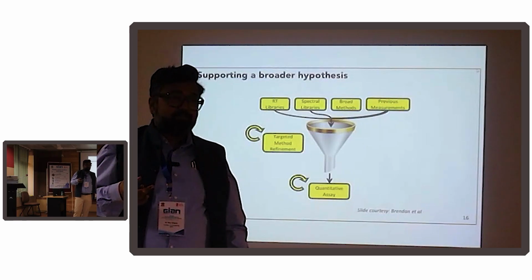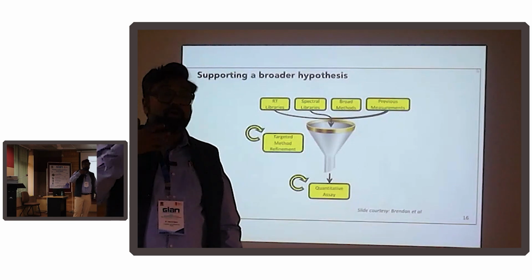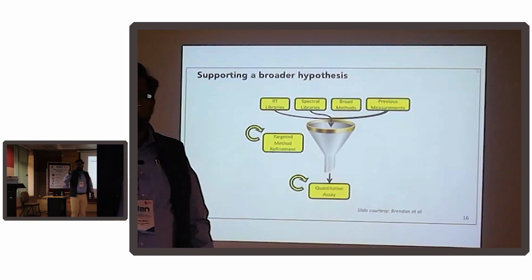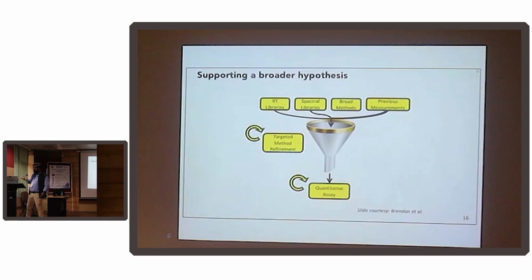Every time you inject the sample, it will detect at a very low limit of quantity. You can also quantitate how much of your target protein is present by creating a simple standard curve, like you do in protein quantification, right? So you can do quantification, and you can do very sensitive detection.